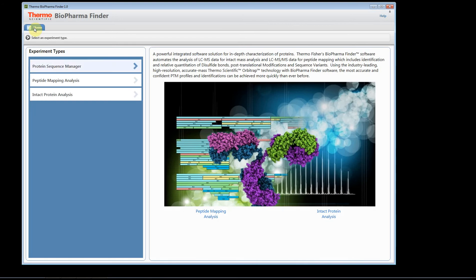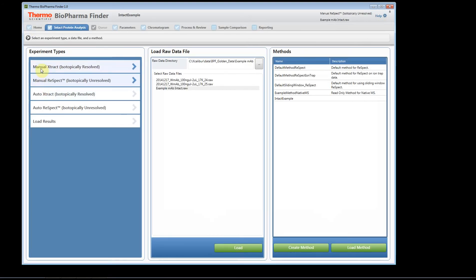Now let's go back to the home page and go to the intact protein analysis. This is exactly the same as Protein Deconvolution 4.0, so those of you who have used Deconvolution 4.0 should find very little learning curve. When you first start, you have different options: Manual Extract, which looks at isotopically resolved data only; Manual ReSpect, which is for non-resolved isotopic data; and automated versions of both.